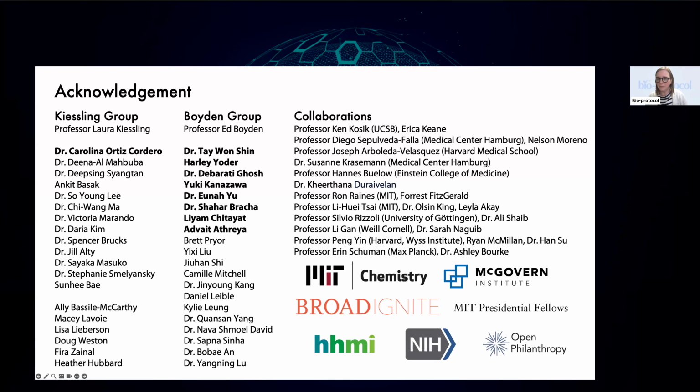Someone is asking a microscope question. How critical is it to use spinning disk confocal to image versus a wide field or, I guess, a scanning confocal scope? I don't think it's that critical at all. Since the sample's already expanded, you can use whatever confocal you want to use. We use spinning disk because that's what we have, and it has pretty good performance in terms of scanning large areas. But if you want to use other microscopes, it's definitely possible.